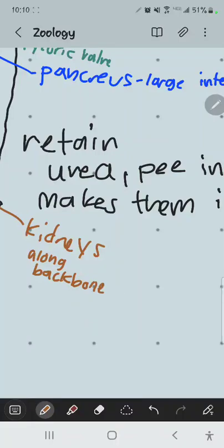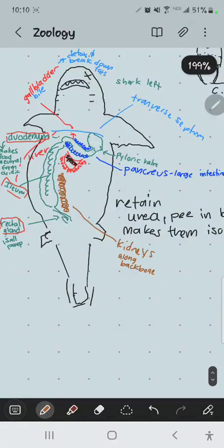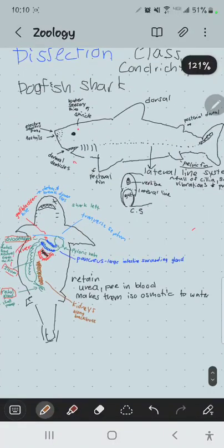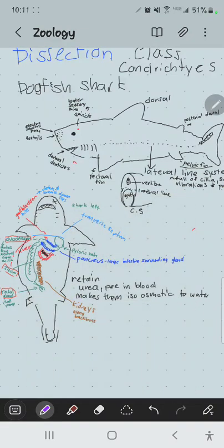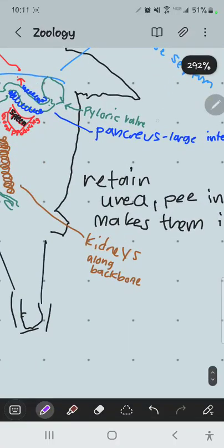Okay, I think that gives us all of the possible internal organs for the shark here. I'll probably have at least 2 or 3 shark dissections, depending on how I feel on the test, and each one will have maybe 3 or 4 questions added. One of them will probably be focused on the digestive organs in green. Another one will probably be focused on the body cavity organs, liver, spleen, kidneys, pancreas, gallbladder, etc. So that's all stuff that's going on here in the peritoneal cavity.